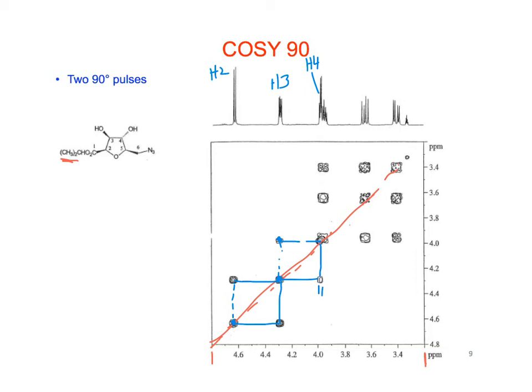And the other thing you could do, sometimes when you have them on paper, it helps to get a ruler and lay it right through here and right through here, and notice that that one would be off to the side. The center of this one goes into the center of this other side over here. Or even better, if you have it on the computer, you can just move the cursor and see what lines up. Okay, so that's H4.